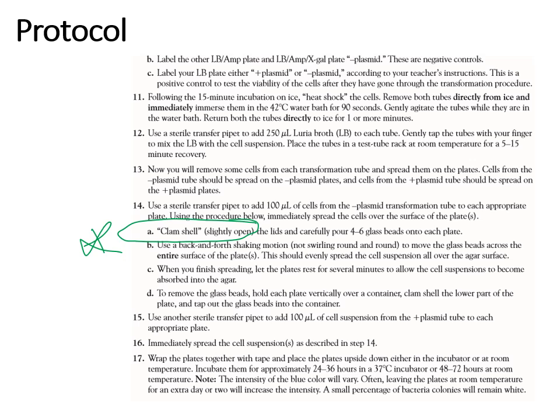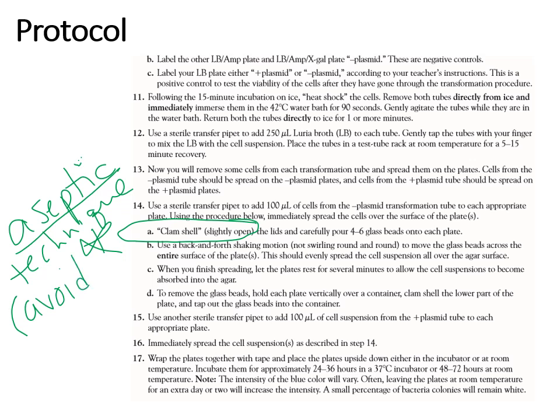Okay, so clamshell in labs is very important for what we call aseptic technique, meaning you don't want any extra bacteria getting on those plates. So you can write this as avoiding contamination.